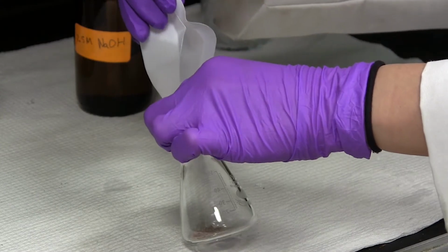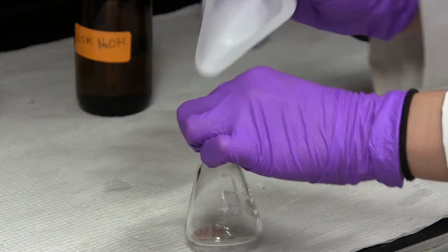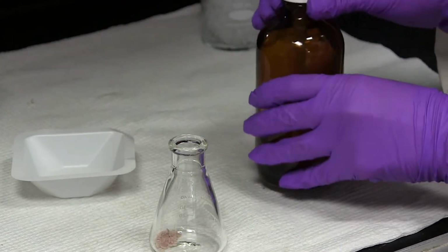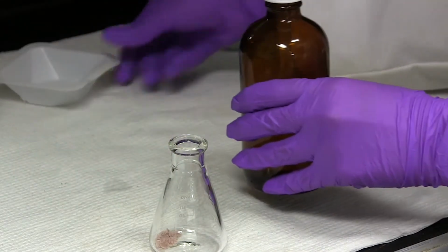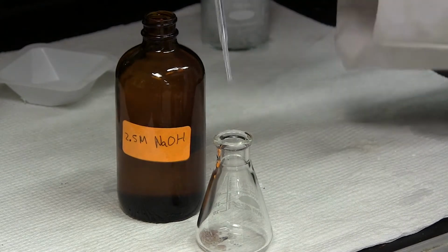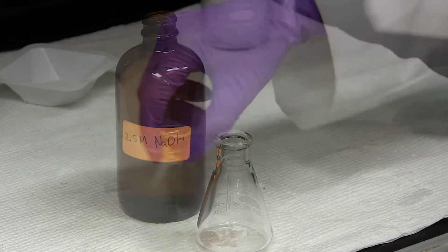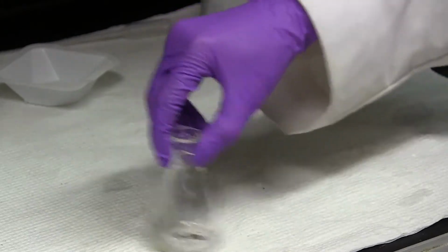Weigh out 2.6 millimole of your assigned coupling reagent, in this case 1-naphthol, and place it in a 50 milliliter Erlenmeyer flask. Add 2 milliliters of a 2.5 molar sodium hydroxide solution. Dissolve the solid and place it in an ice bath.